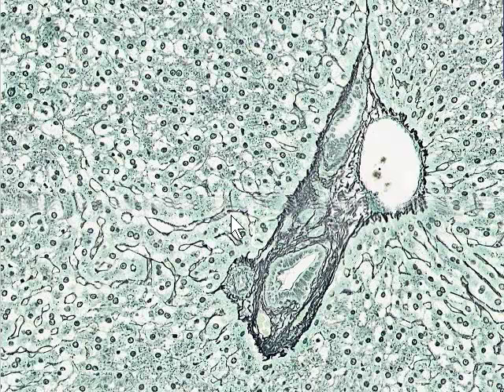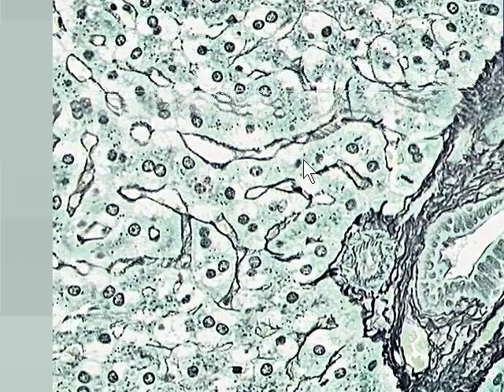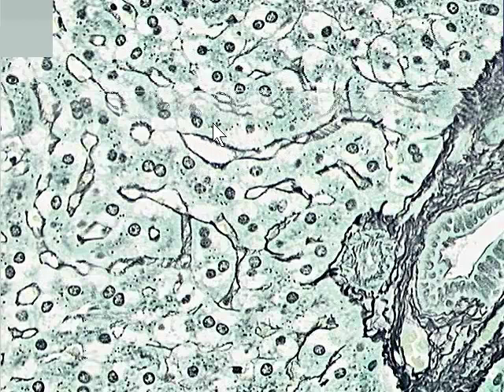Really what we want to look at here is what looks like a thin inked line which is drawn here. Just inside, here's a plate of hepatocytes. Why don't we go just to a little higher magnification. So here we have a plate of hepatocytes, and here we have the reticular fibers occupying the space of Disse and forming part of the sinusoidal lining. In a tissue preparation like this, we don't easily see the endothelial cells which line the sinusoids.